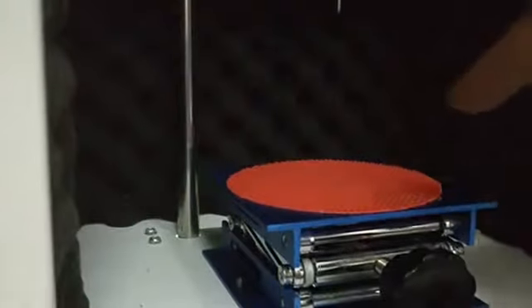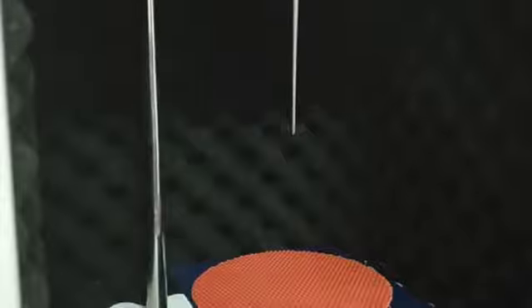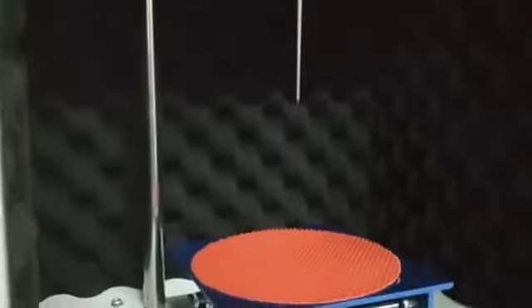Now on the bottom, you can see this is one platform. This platform is used for higher volumes. This is a 2mm probe, so here the maximum volume we can use is 0.2 to 5ml. Definitely we cannot use 5ml volume on this, or we can put some vial in some beaker on ice. For higher probes like 6mm, we can use this platform.